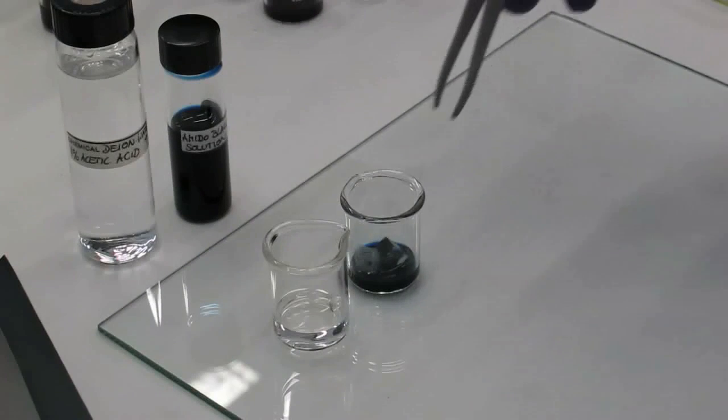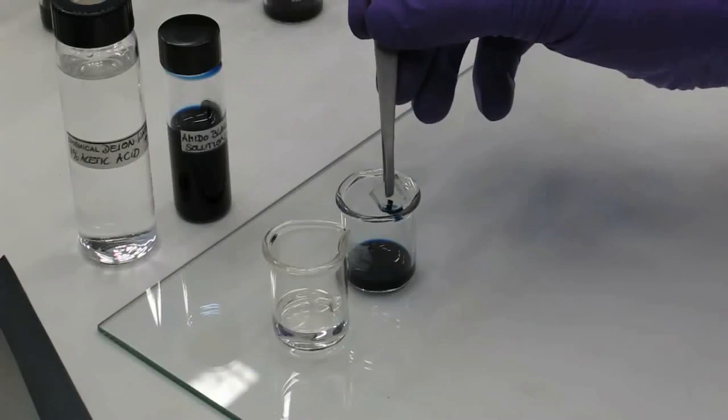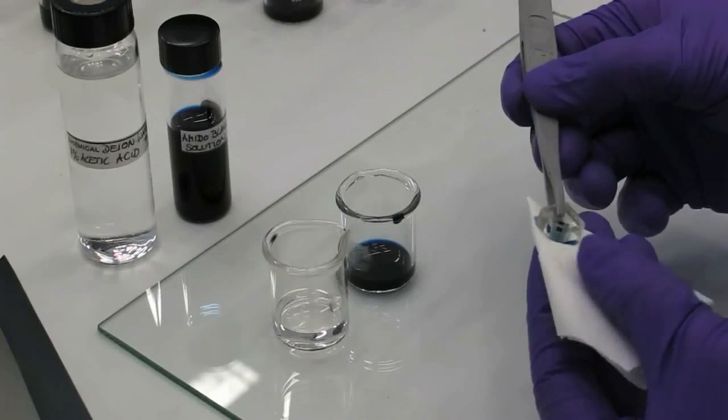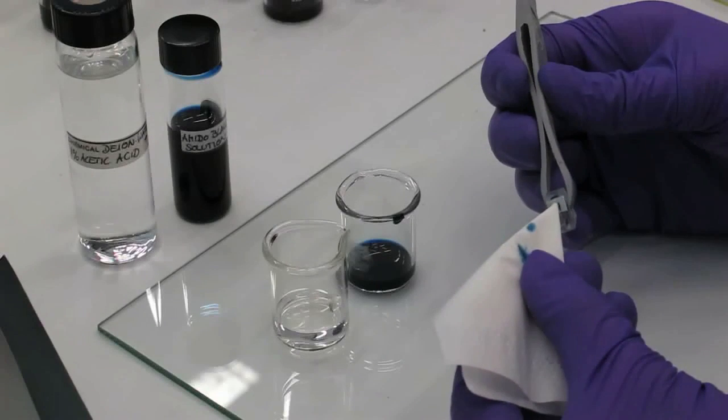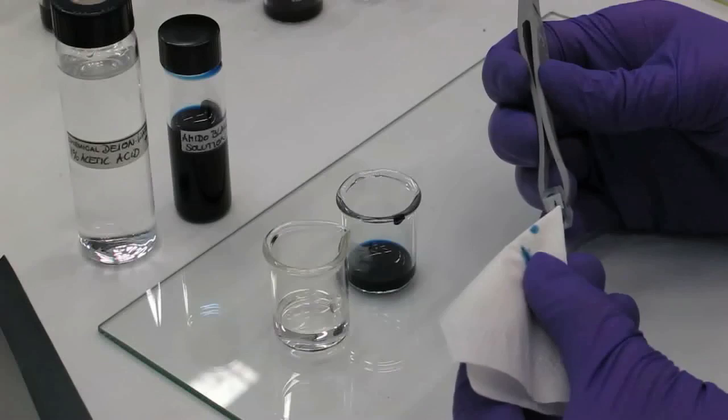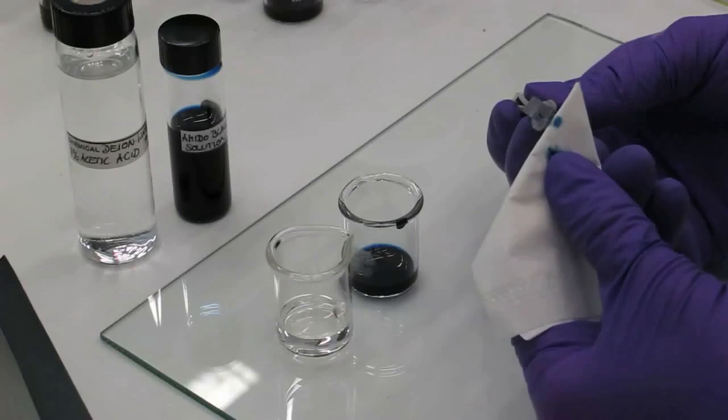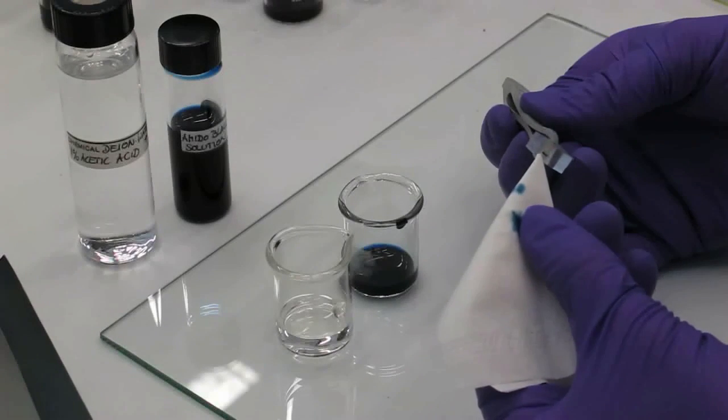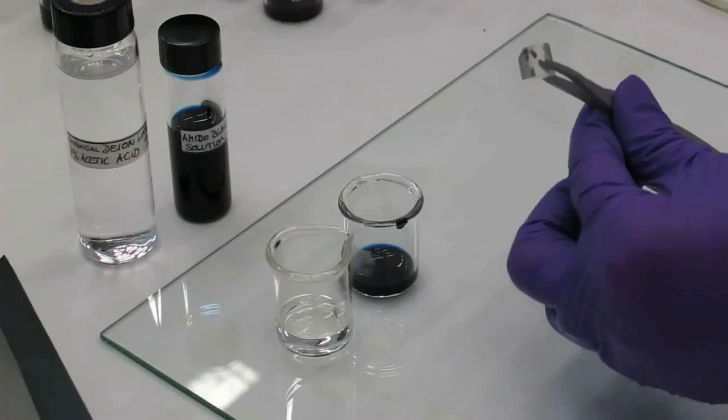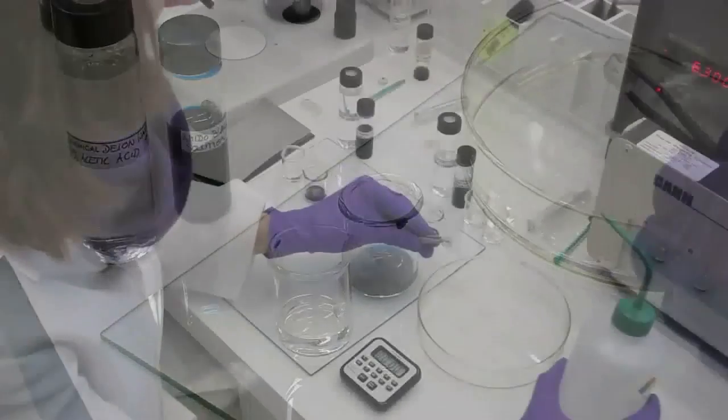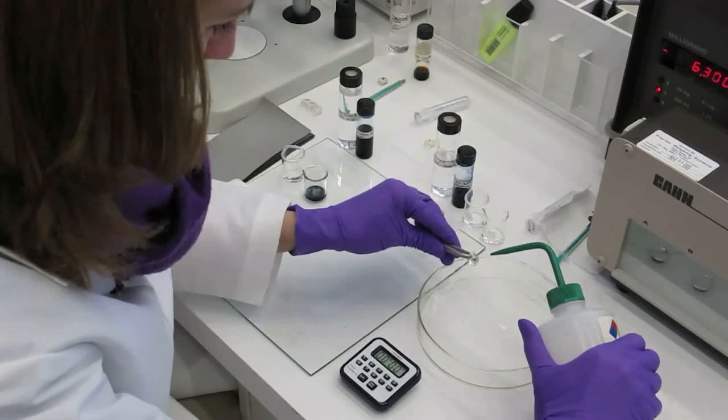Staining with Amido Black requires leaving the cross-section sample in the staining bath for approximately 15 minutes. The sample surface is then rinsed with a 1% acetic acid solution until no further stain can be removed from the sample.